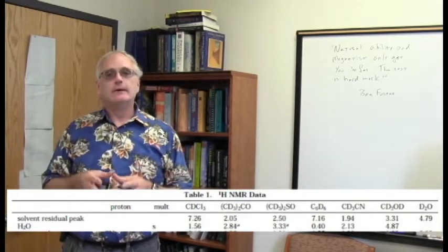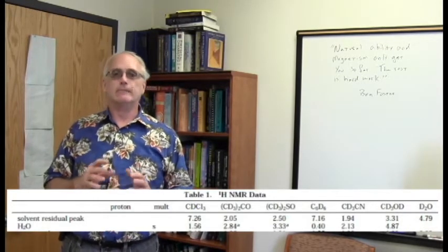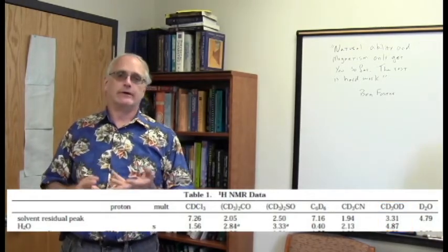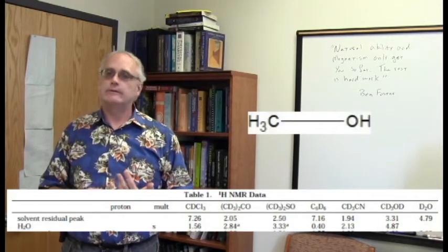The last number that I'll call your attention to specifically is water in methanol. Now we have a very polar solvent, but also an excellent hydrogen bonder. Okay, it's much like water that way.